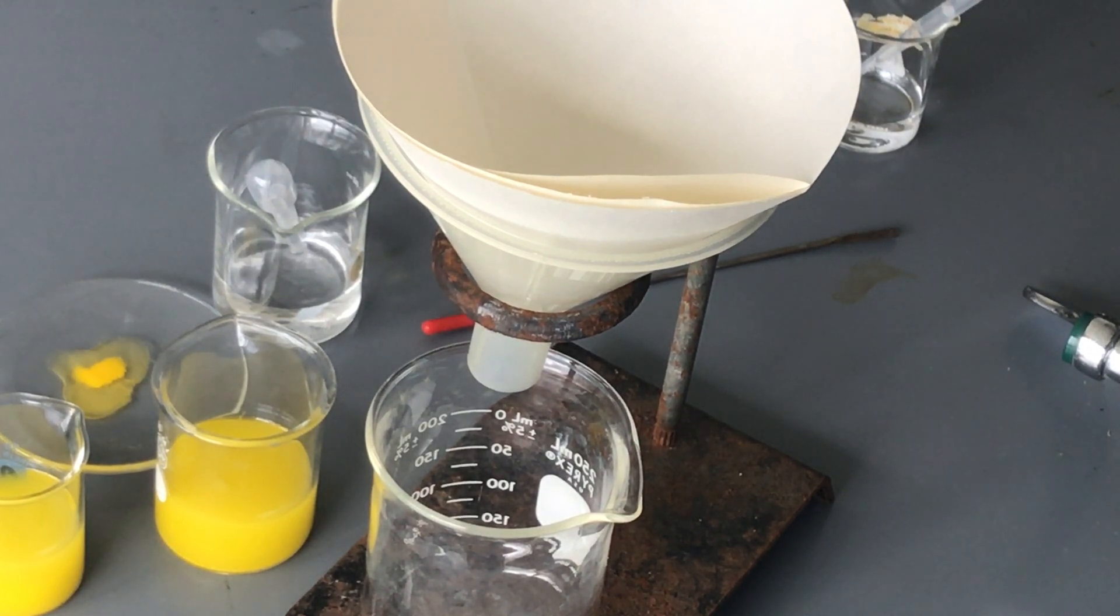We've got a ring stand, got a beaker below, and I got filter paper. In the yellow we have the material that we made in a previous demonstration, which is the lead compound or lead iodide that was made in the double replacement.